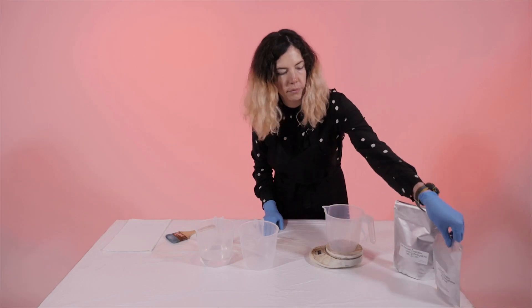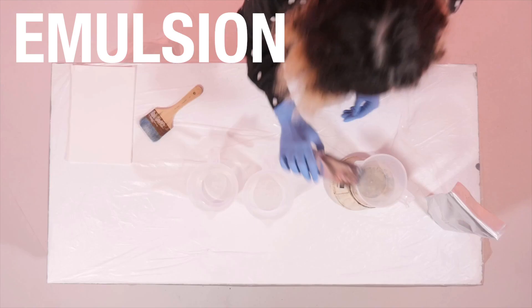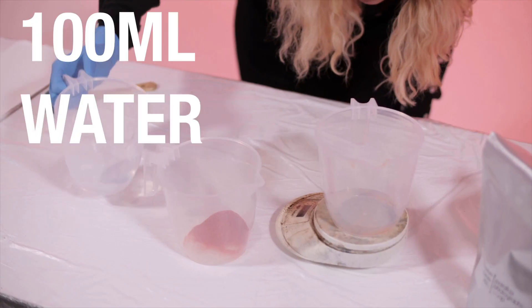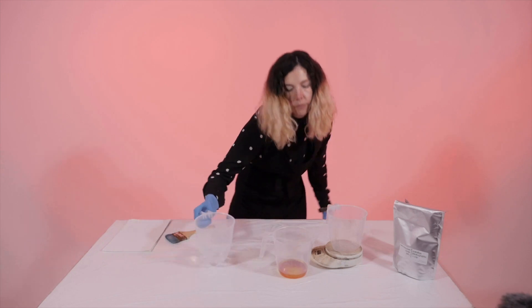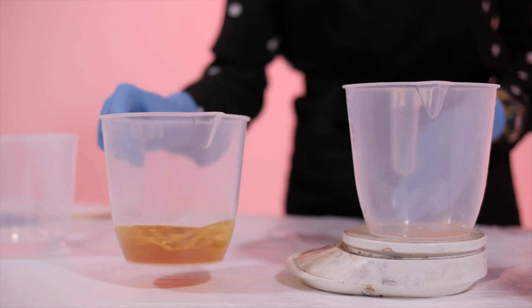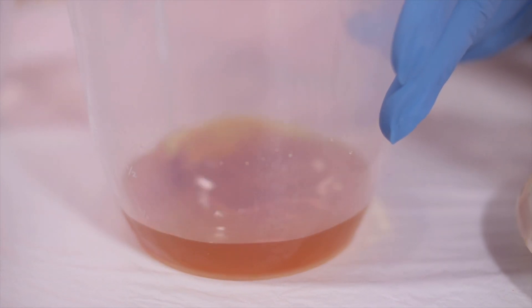We are now measuring out the potassium ferricyanide. It is a very bright red colour. We are making an emulsion which is basically like a paint — but unlike other paints and emulsions, this will be sensitive to light. We are measuring out 10 grams, then adding 100 millilitres of normal water. You should mix until all of the red crystals dissolve. Potassium ferricyanide can take a little while to dissolve, so just keep stirring until all the crystals go. You should end up with an orange liquid.